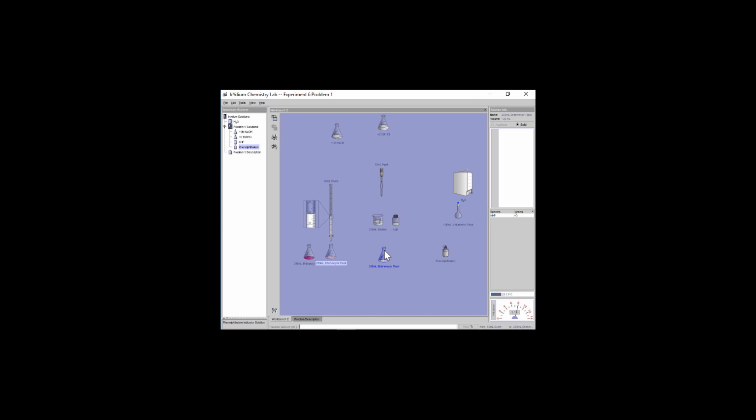So you see that one here, first thing, it hasn't overshot. We haven't gotten fully pink excess hydroxide. We actually saw the first instance of color change. That color should last on the order of about 15, 20 seconds or so. And that way you know to stop. And that way you'll know to be able to do your stoichiometry.